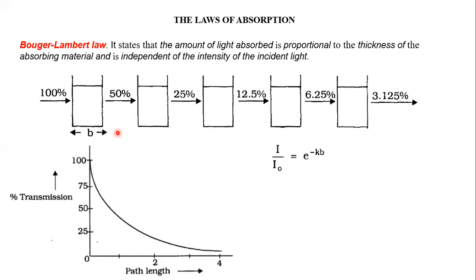So compare it with a single gelatin sheet, and you are looking at the light coming out, and two gelatin sheets, and now you are observing the light coming out. What exactly will you observe? What will be the difference? Less light, less bright will come. So how will it appear if it is red? Will it become dark red, in case you are using two gelatin sheets? No, sir, it will become light red.